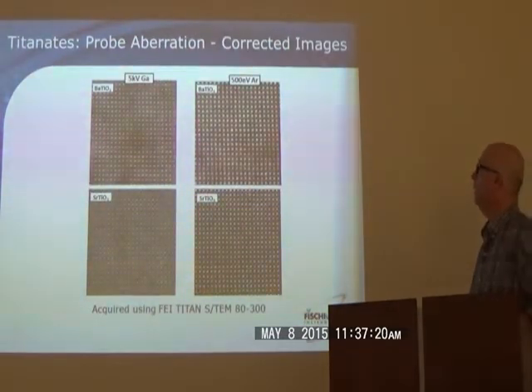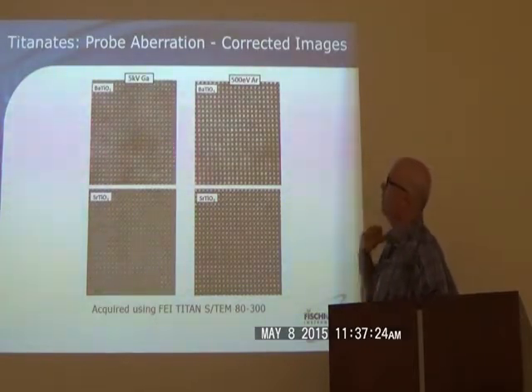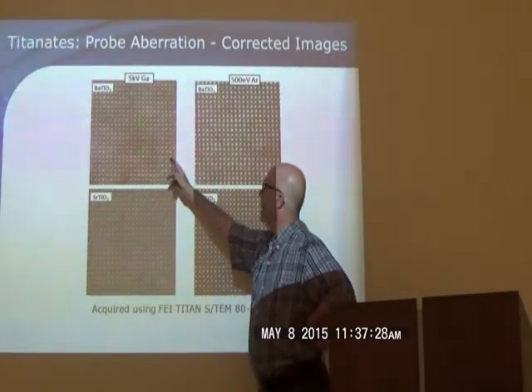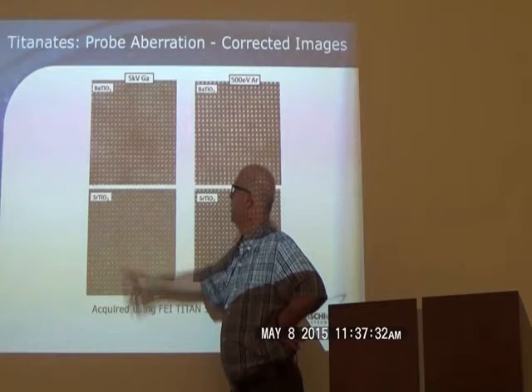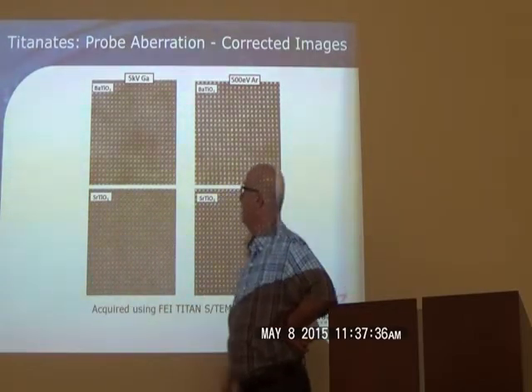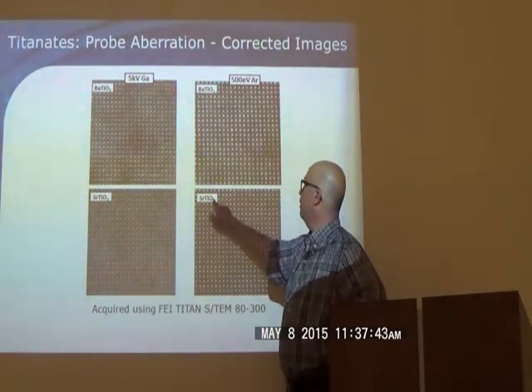Let's just take a few quick more examples. Let's take 3 ions and put them in one solid. So this is a barium titanate. So there's actually barium, titanium, and oxygen making up this material. This is a strontium titanate, strontium, titanium, and oxygen. It's often difficult to pick out the individual ions. The holy grail there is to get all 3 visible.